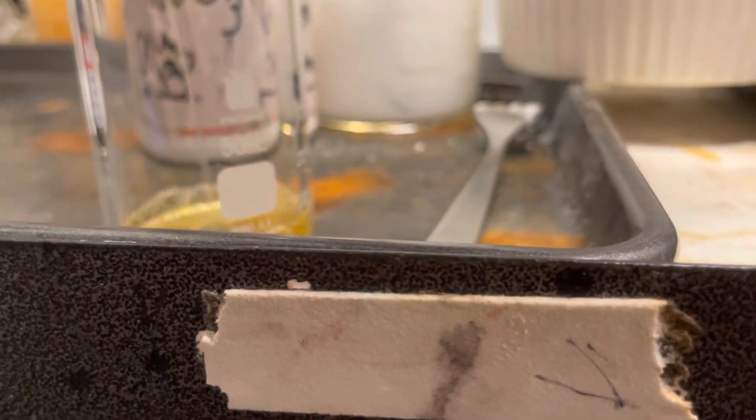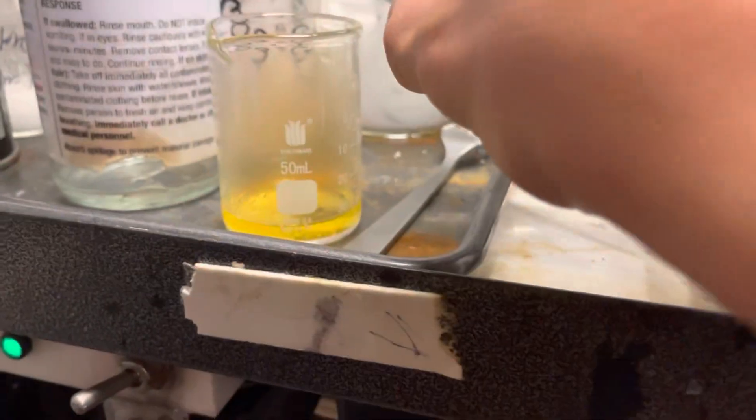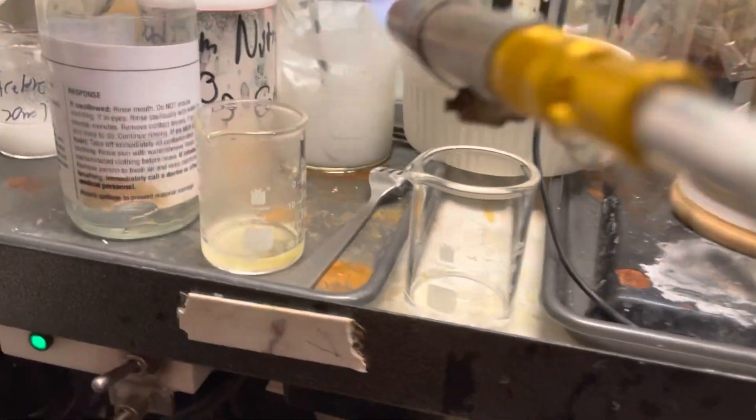...evolved some red gas. So there is some nitrite. Then I added methanol to see if I could make methyl nitrite. And indeed, there was methyl nitrite. So I guess this is a viable option for synthesizing alkali nitrites.